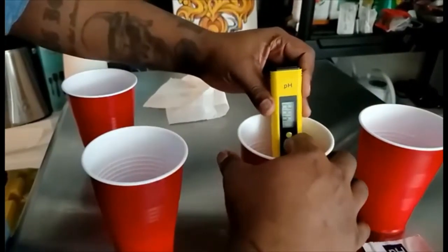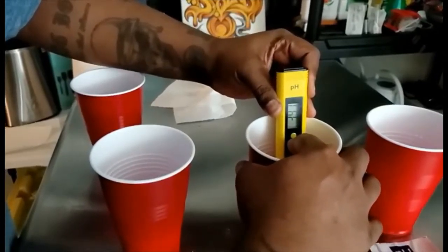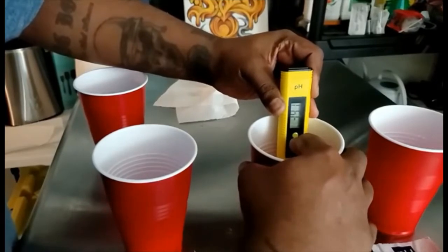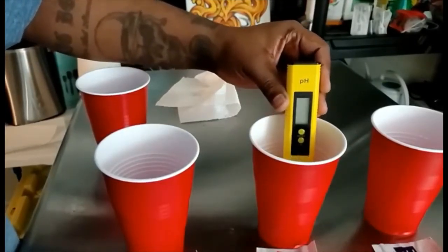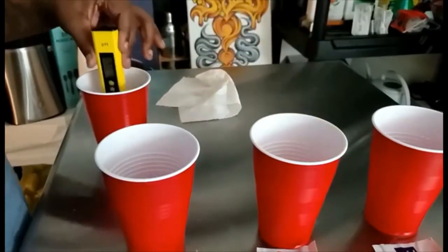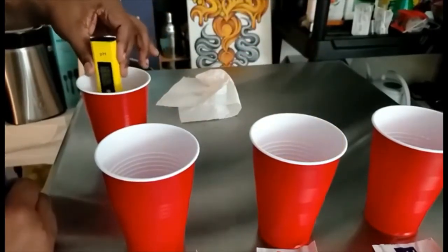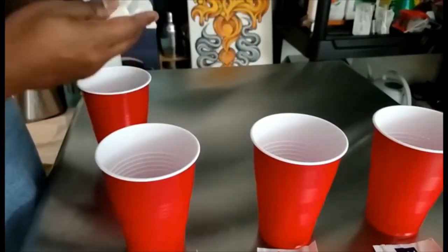Make sure the tester is on, then stick it inside the 4.00 solution. Hold the calibrate button for five seconds, release it — it's going to flash three times and you're going to see 4.00 on the meter. Once you see that, clean the electrode with distilled water and dry it again.